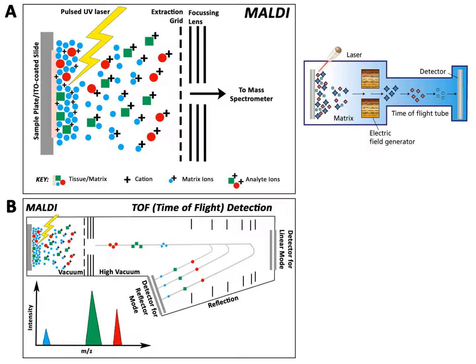And they're going through these electric field generators that put all the charged particles in line, and notice you have a large time of flight tube that allows these fragments to separate by size, and then they hit the detector, kind of like throwing a softball versus a golf ball, okay, at a detector. You're going to get a fraction of a second difference here.